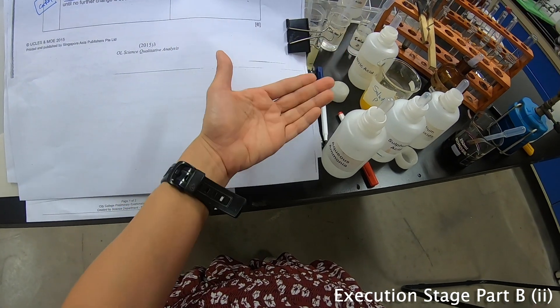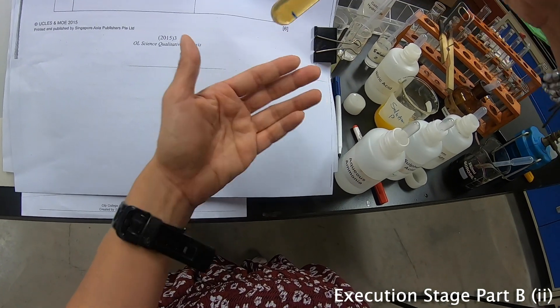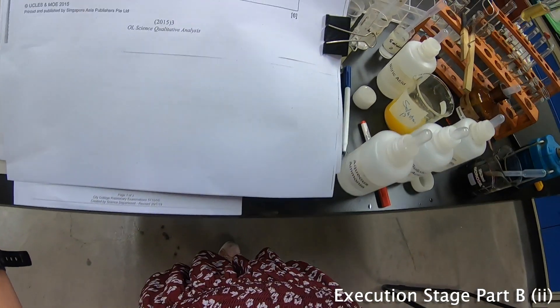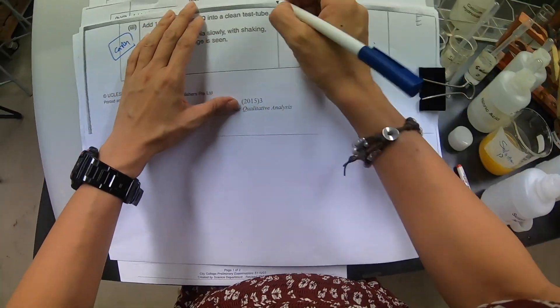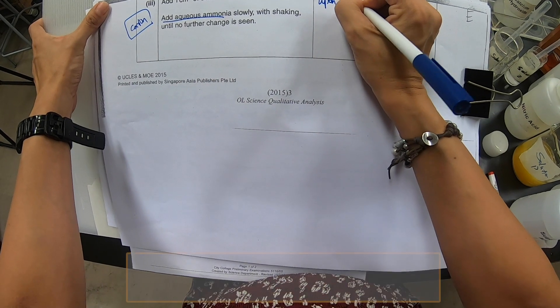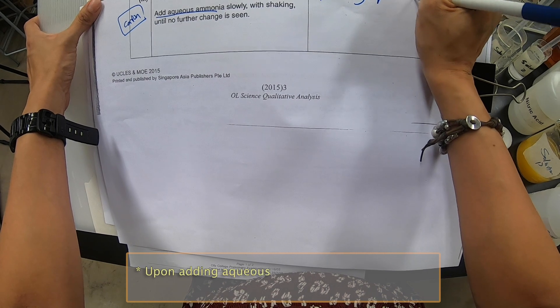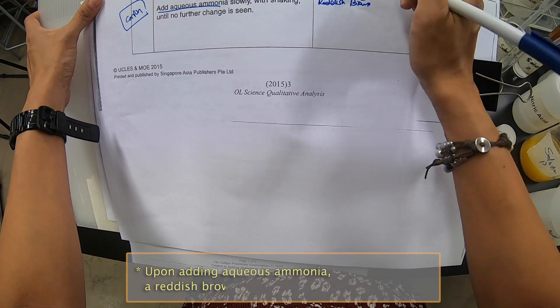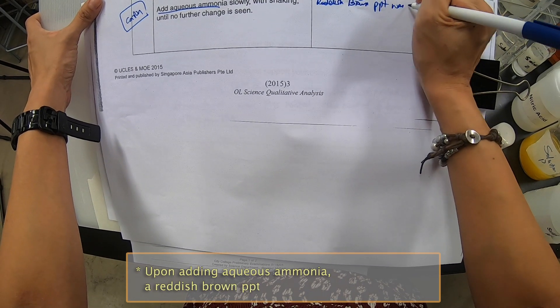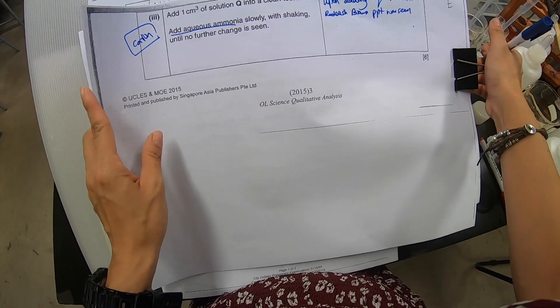I can see precipitate forming, and it is a brown precipitate floating all around like a suspension. We don't say suspension though — we just write: upon adding aqueous ammonia, a brown precipitate was observed. So let me write this down: upon adding aqueous ammonia, a reddish brown precipitate was seen.